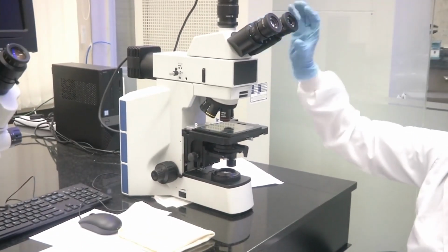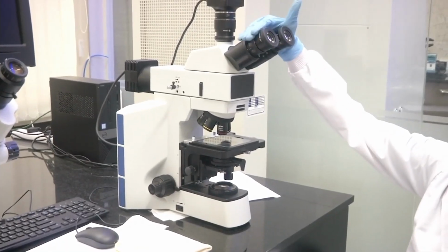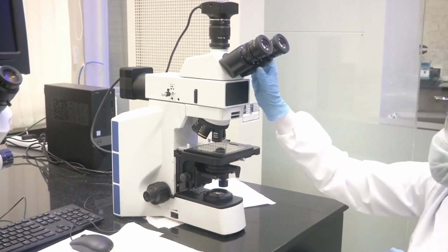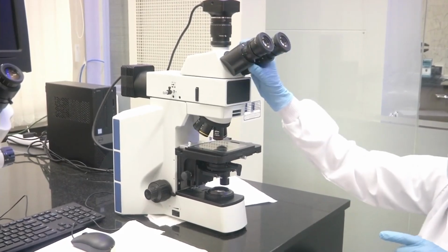So, the eyepiece is from where you see the samples. The eyepiece provides 10x magnification, usually most of the time. If you look at whatever is written on the side, I think you might not be able to see, but this has 10x magnification.